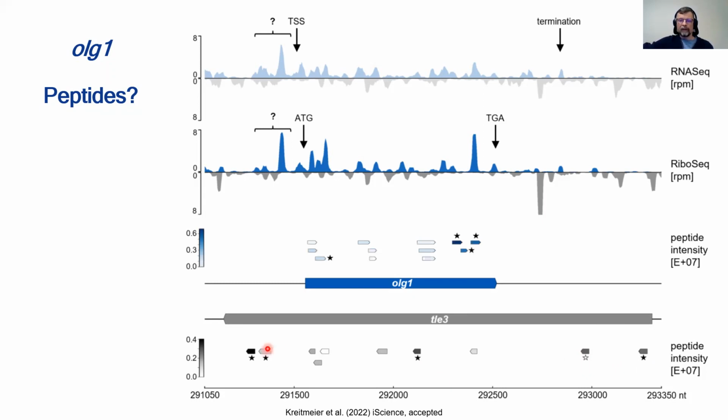And interestingly enough, we also found peptides for overlapping gene 1. And we confirmed 4 of those using heavy peptides. Excellent. Yes, that was really a breakthrough. This was also the first time that we could show we have mass spectrometry data. So the protein is produced, and here we really have proof of it.